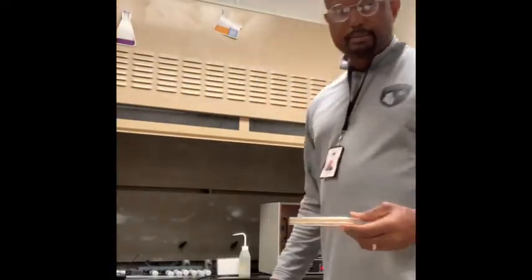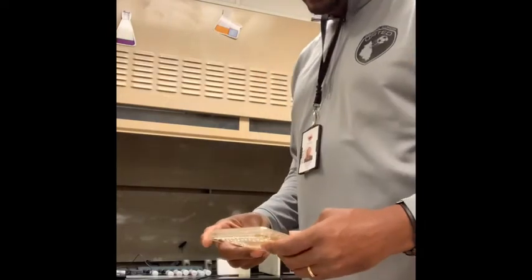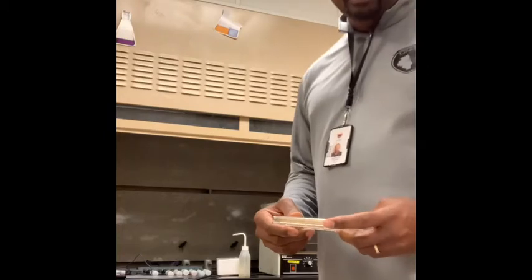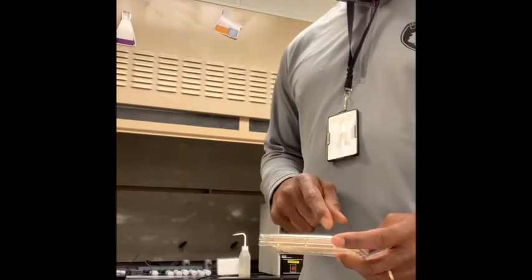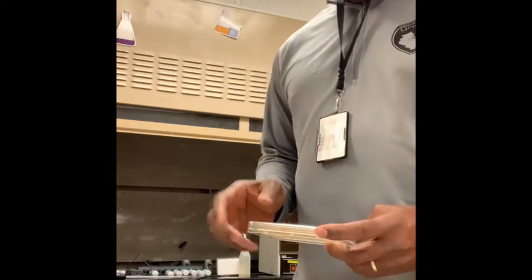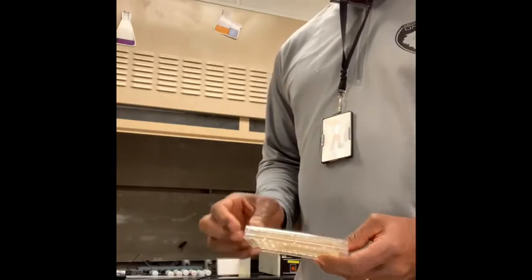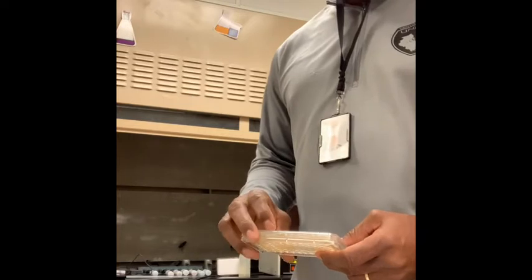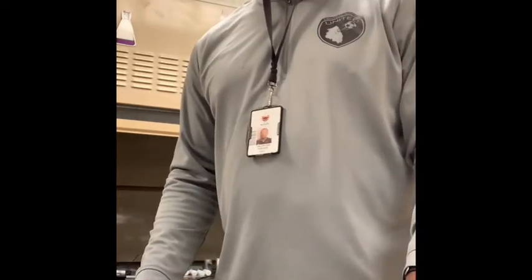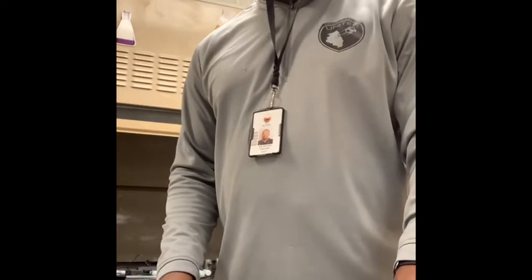Okay, the next step is to remove the plates from the incubator, and now you are looking for the number of wells that have a blue color. And in our case, there are 7 wells that have indicated blue, which means there are 7 wells that tested positive.